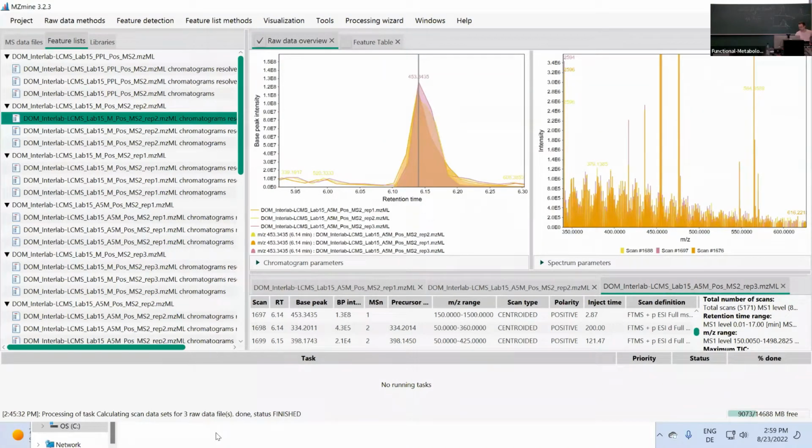So for now, we have some smaller processing steps left. I hope that the alignment worked for everybody. Afterwards, we can filter some results. Should we go through every filtering step now? I guess we're a bit time limited. No, I mean, yeah, do the filtering.